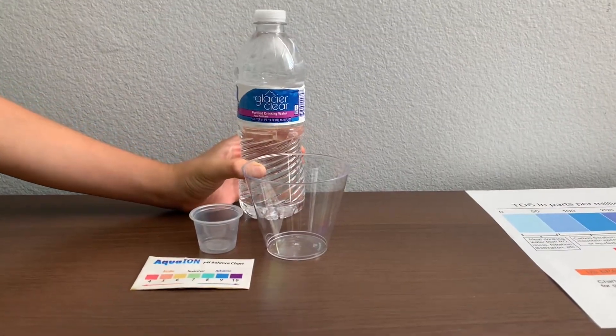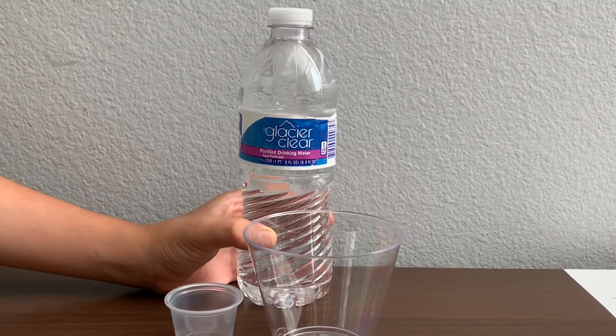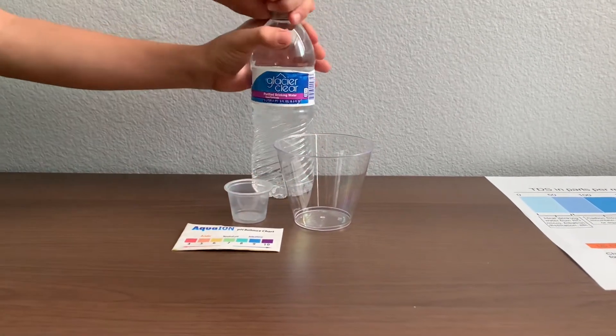This is Glacier Clear Purified Drinking Water. It's sourced from a municipal supply in Las Vegas. Water from Las Vegas — a pack of 24 costs $2.99. Let's test the TDS and pH levels.